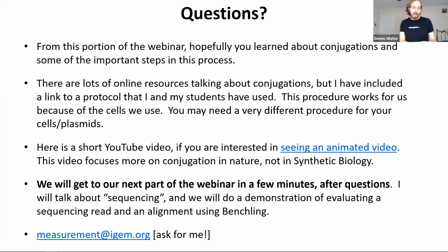So somebody asked, why do you need a 16S sequence to test the strain modification? The Q&A keeps moving as people are doing stuff there. So let me back up a little bit. 16S sequencing means sequencing the ribosomal. So you have ribosomes in bacteria, right? Ribosomes in all of us, but you have ribosomes in bacteria.